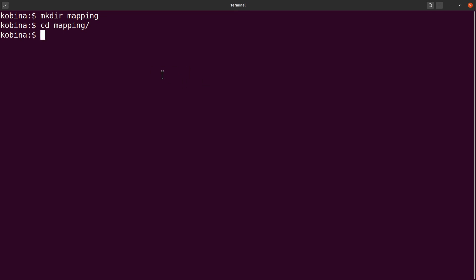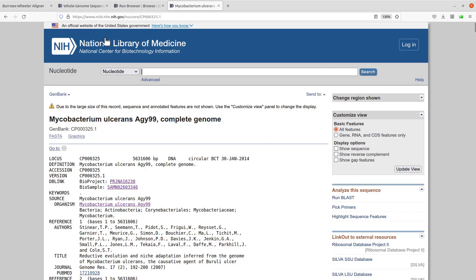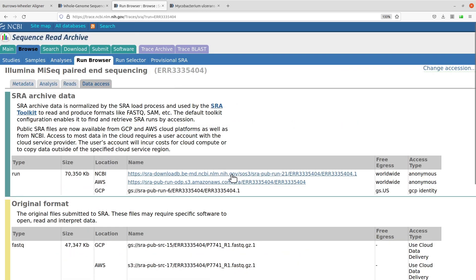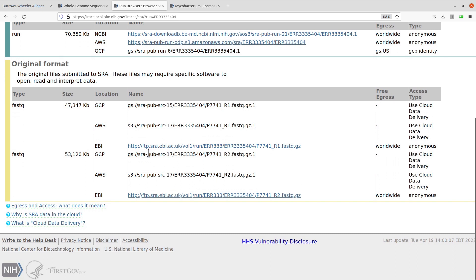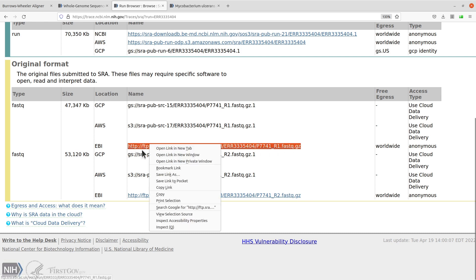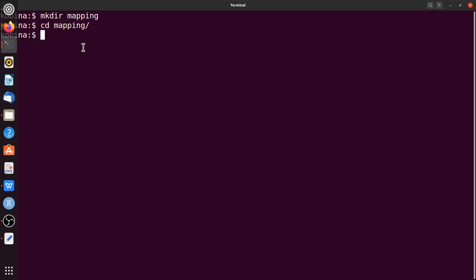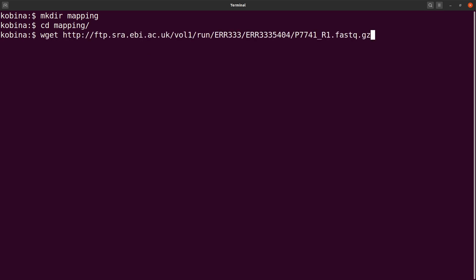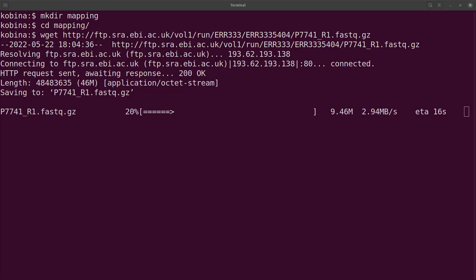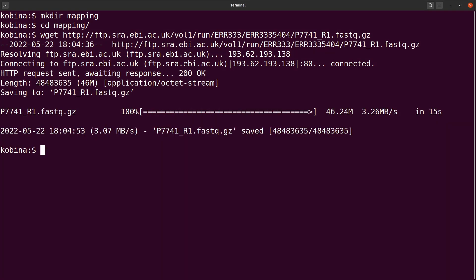Let's go back to the browser and get the FASTQ files. Because I'm using paired-end reads, I need read one and read two. I'll get the download links from the SRA page. I'll copy the link for read one and move to the terminal, where I'll use wget to download it. Read one has been downloaded.